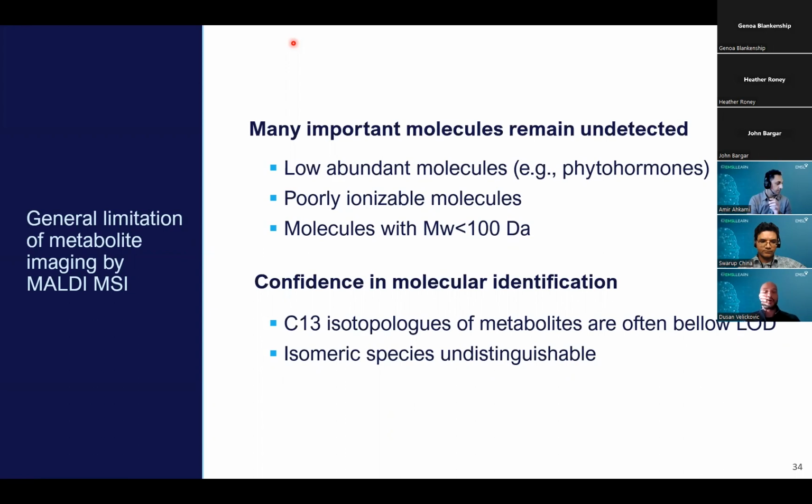So that is also a problem, and a lot of phytocompounds, for example pyruvic acid and some other aldehydes, are also non-detectable in the traditional MALDI mass spectrometry imaging workflow. And the second challenge is confidence in molecular identification.